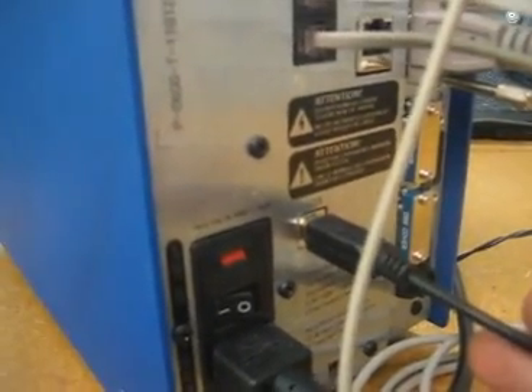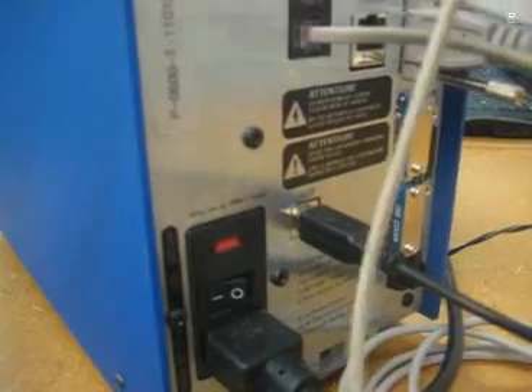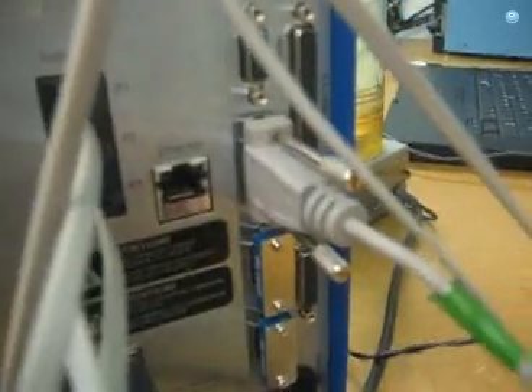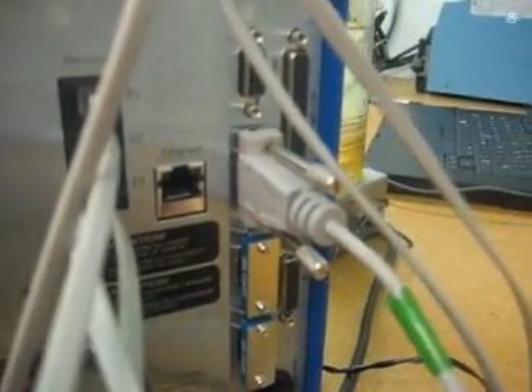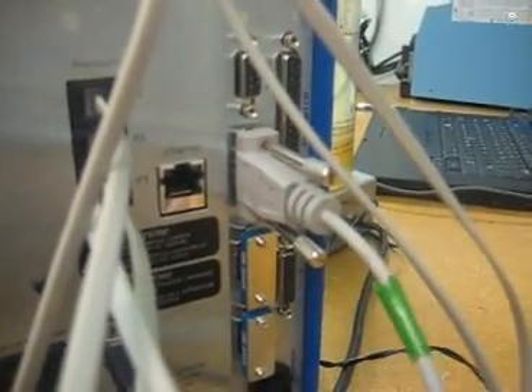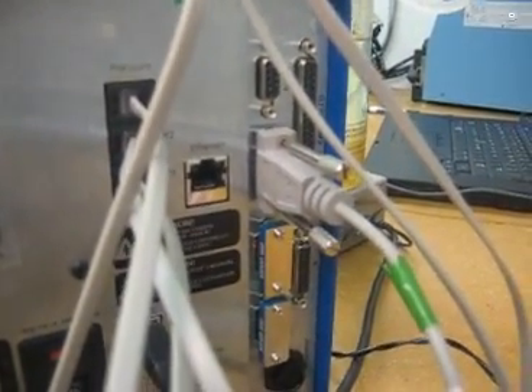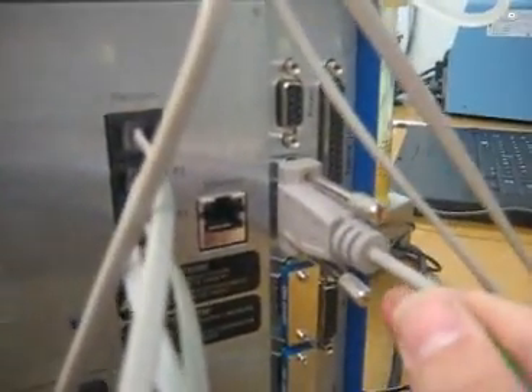There's a USB cable shown here which is going to my laptop and the PsyDoc software. PsyDoc is not included by the way — it's an extra charge. This cable here is a balanced communication cable which allows the system to automatically monitor, record, and make decisions based on the balance values. Again, that only fits in one spot and it's labeled S1 for scale.